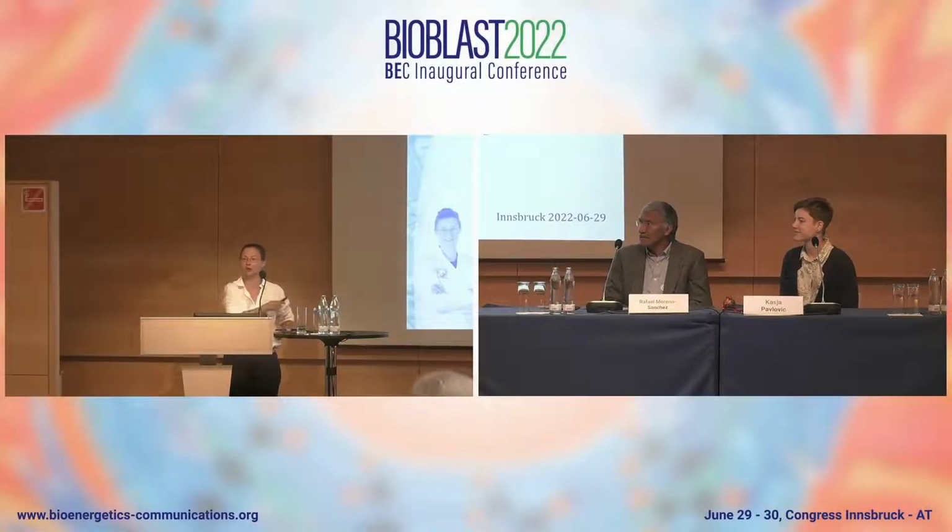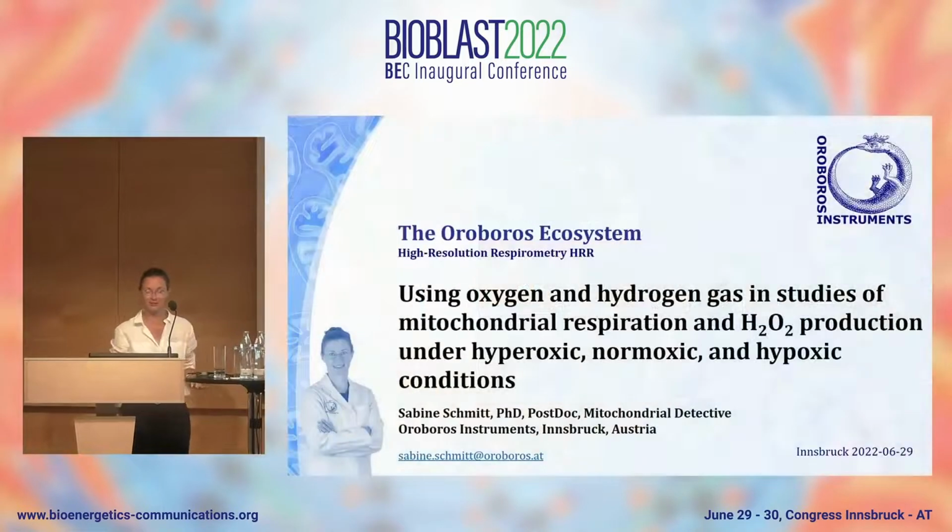Actually, I wanted to thank Chris for the introduction for my talk, because he was going to give the definitions, so the theoretical background for the very practical things that I was going to talk about: using a wide range of oxygen concentrations when measuring mitochondrial function with the O2K.